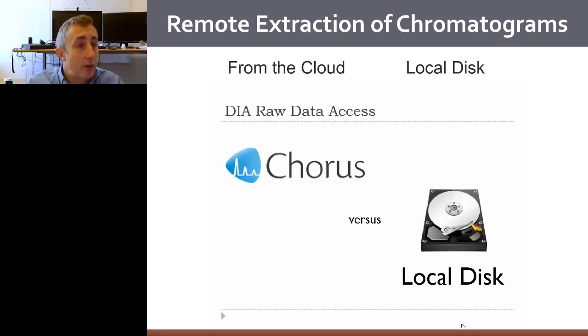It ends up taking about an hour and a half to download in full. And so if we import it locally from the local disk, now that we've downloaded it, took an hour and a half, there's importing 6 different files into Skyline from the local SSD, and we're limited now by the hard disk, the CPU infrastructure of the laptop, versus from the cloud. So we can go and import the results from the cloud.